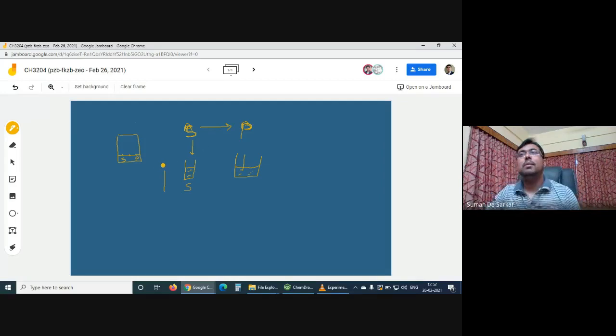And sometimes it happens that this starting material and product, their mobility is almost similar. It can happen. Actually, in this particular case, the indole case, it happened. So it's a good practice that you also make a co-spot in the middle. It's called a co-spot, where you spot this S as well as this P. Why am I saying so?